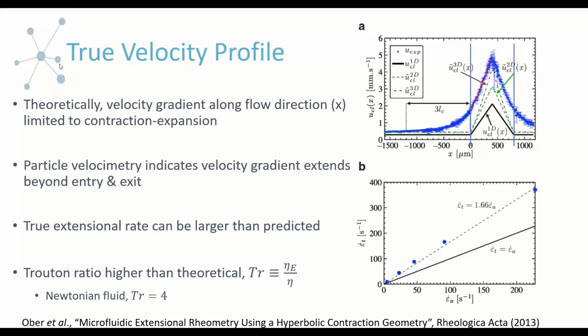So let's look at what the true velocity profile is. I've pulled this from the reference listed at the bottom of the slide. I would recommend this reference. It's pretty high level in terms of equations, math, derivation and theory, but if you can get past that, it did a very nice job of analyzing our EV-ROC system. I borrowed this image from them because they did some particle velocimetry to let us know what this true velocity profile looks like in the flow channel.